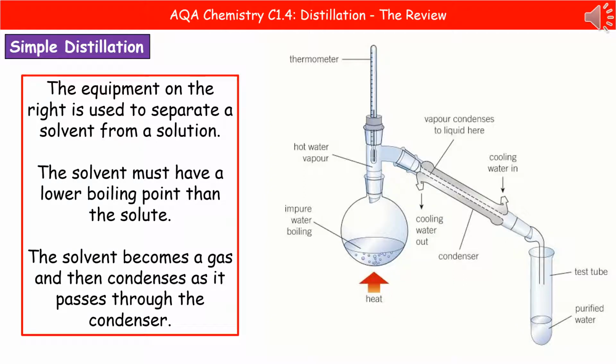Welcome to our review on distillation. What we're going to do in this video is have a look at two different types of distillation. The first one is simple distillation.